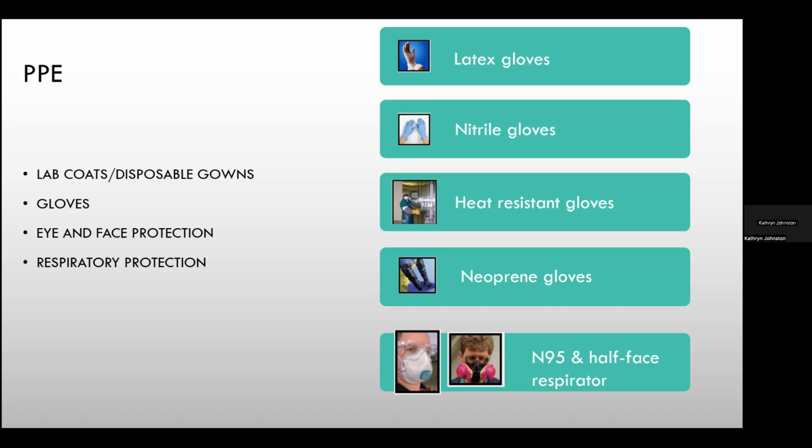Gloves or hand protection. So hand protection is needed if there's a potential for skin absorption of harmful substances, chemicals, or thermal burns, electrical dangers, bruises, cuts, punctures, fractures, and amputations. So the type of PPE required may include gloves, finger guards, arm coverings, elbow length gloves. So what are some of the things to know about gloves?